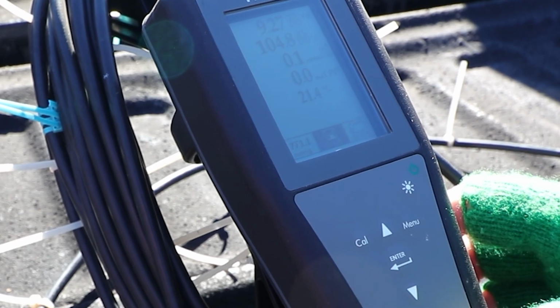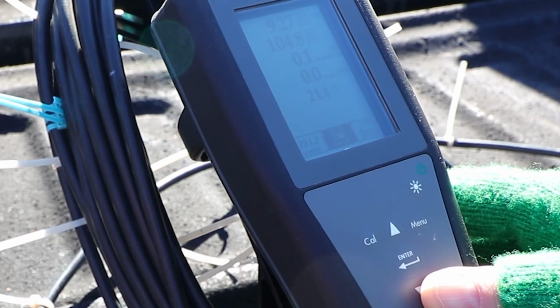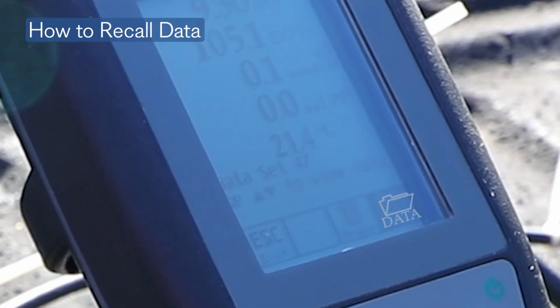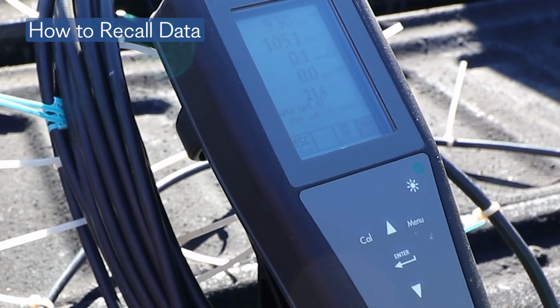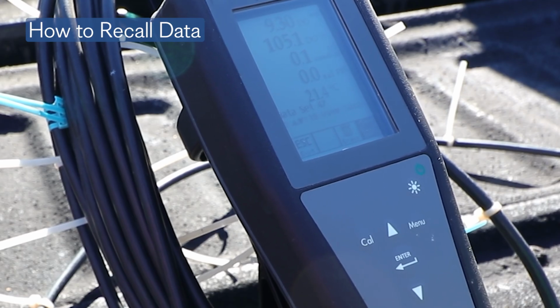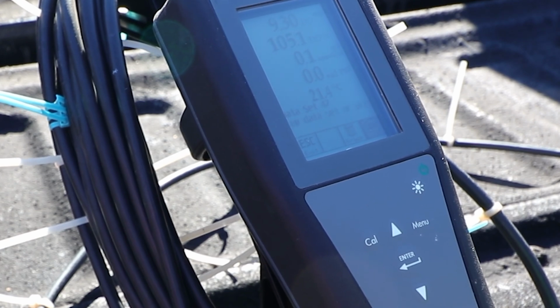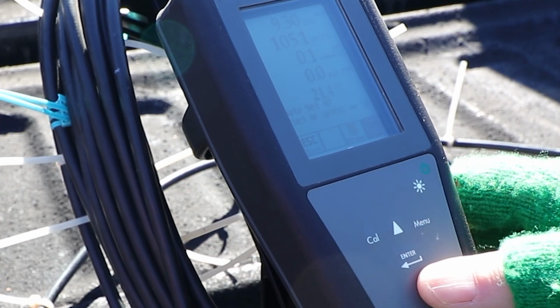Once you're ready to recall the data and to record your numbers on your data sheet, just press the down arrow to highlight the data folder and then press enter. This will pull up our most recently saved data. In this case, it's dataset 47. You will then record that data on your data sheet in the appropriate box.